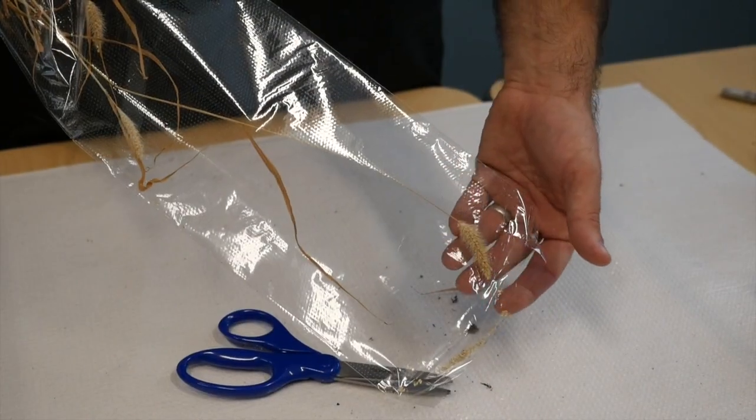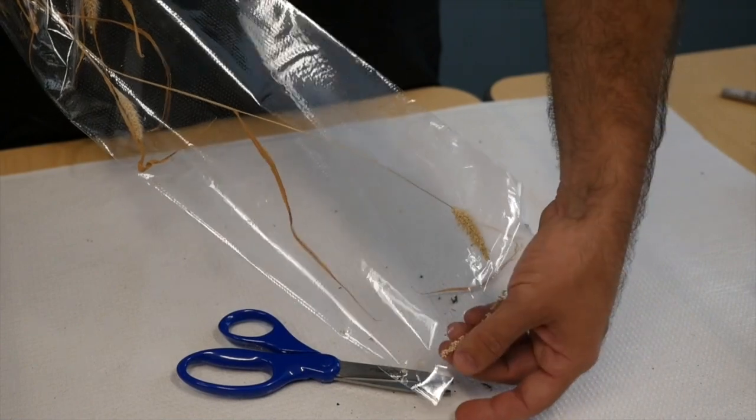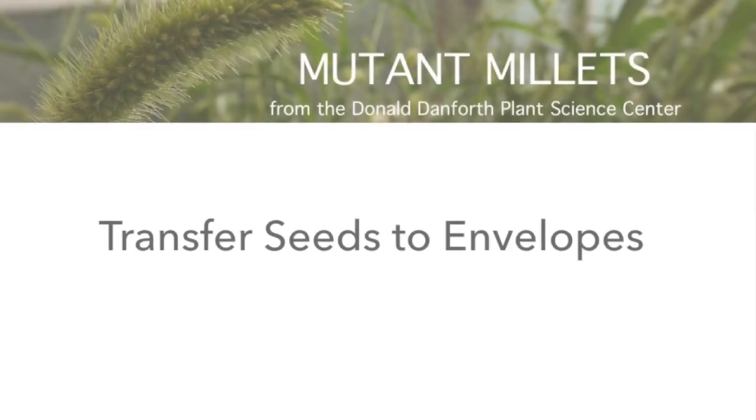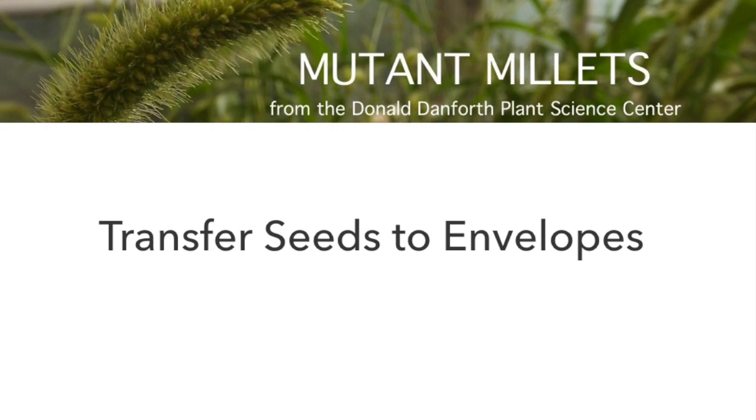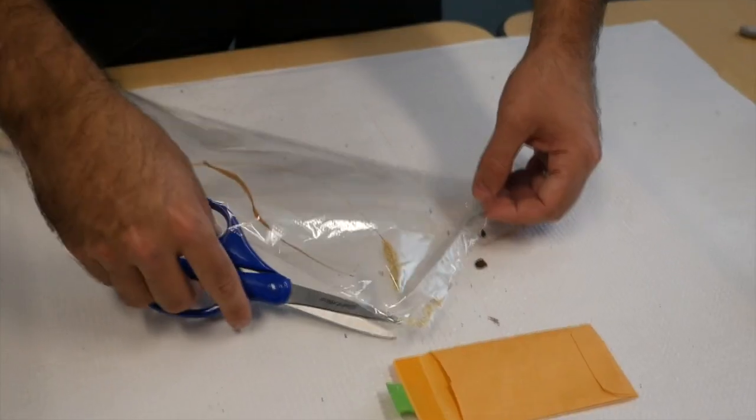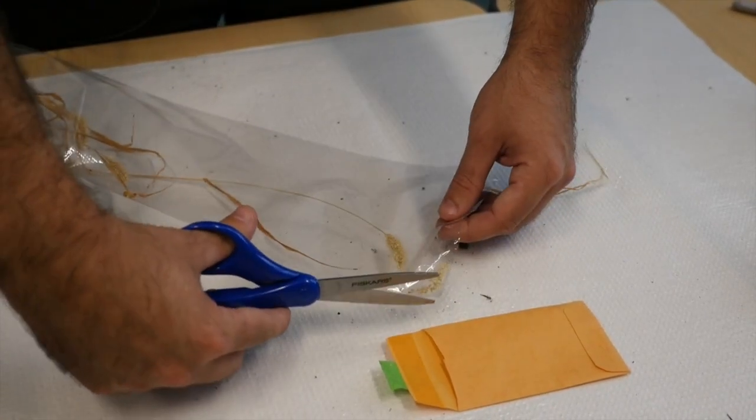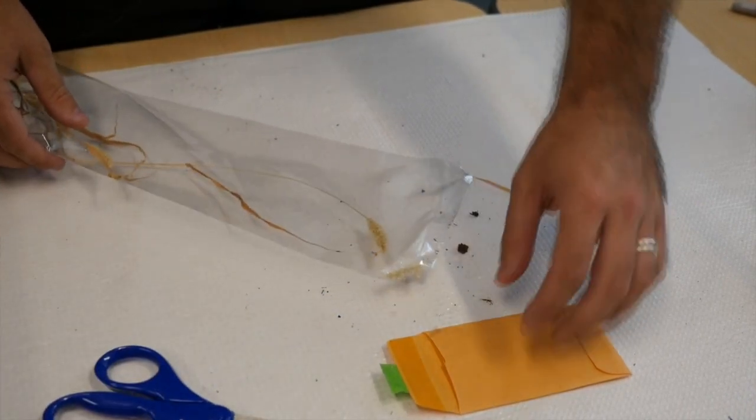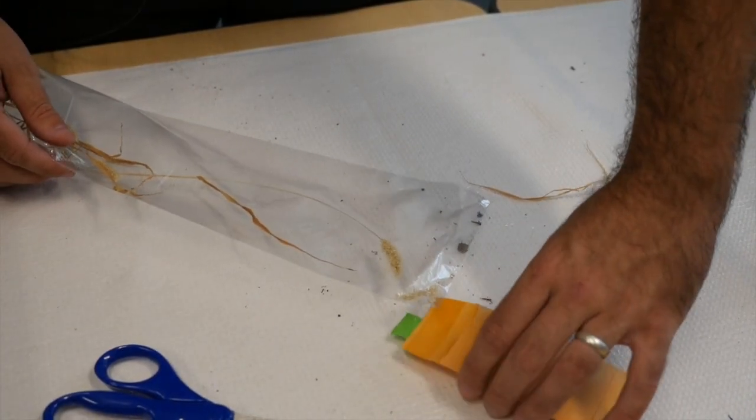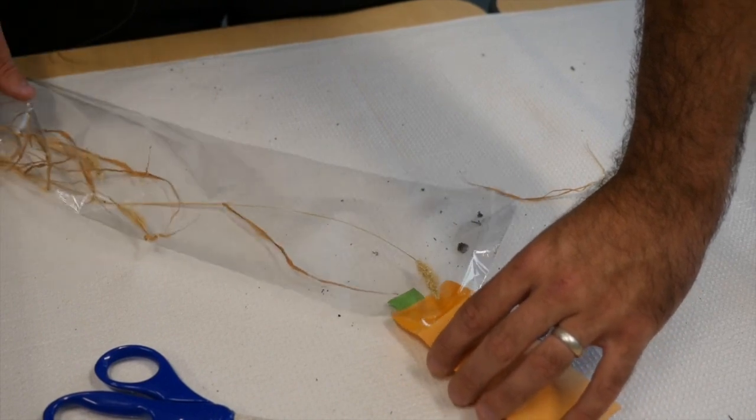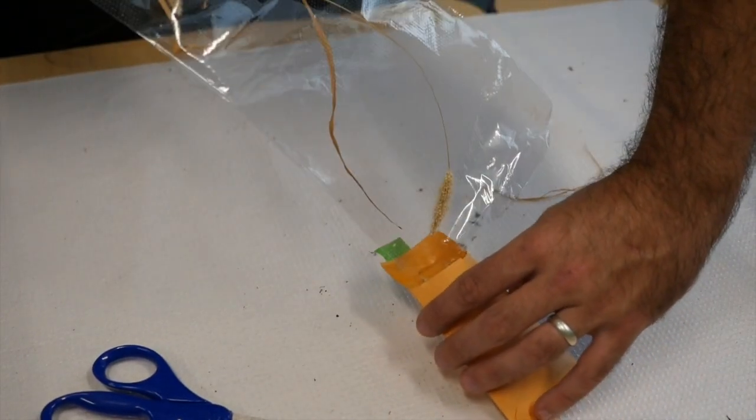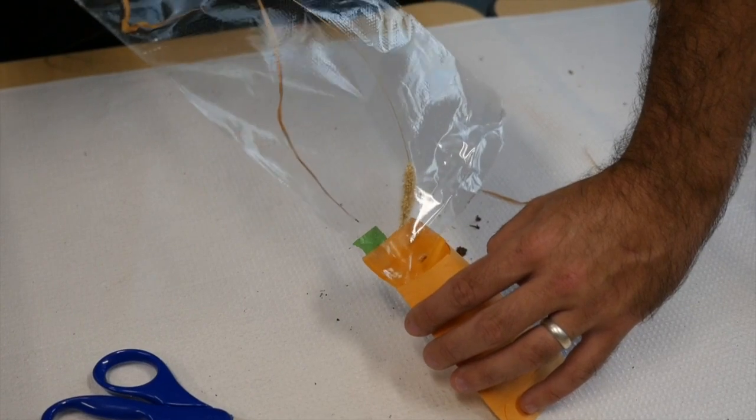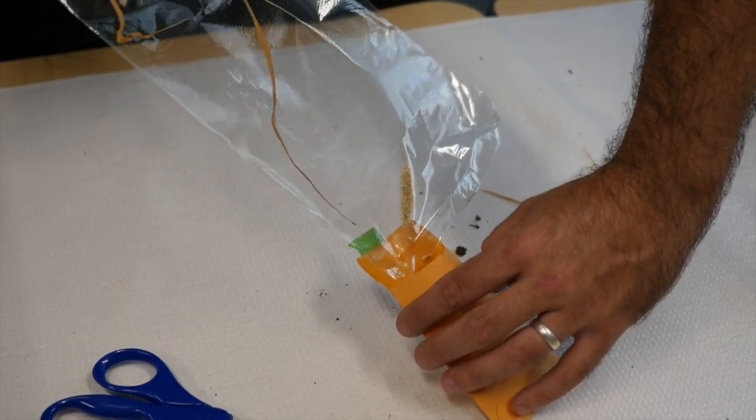After you've gotten most of the seeds, you can collect them at the bottom of the bag. You can slice the tip off the bag and very carefully, without spilling, put the corner in and just gently put the seeds into the seed envelope.